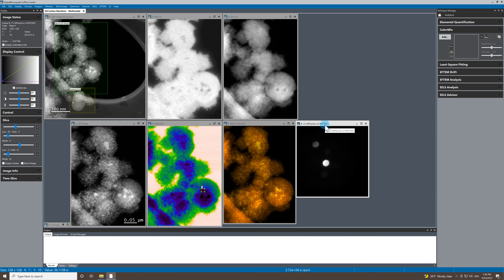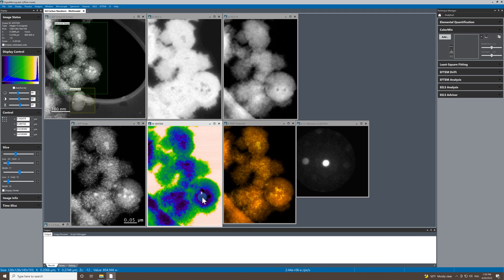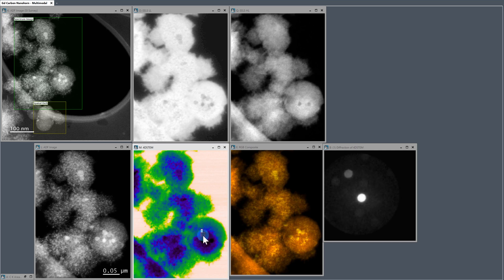If we change the gamma a little bit on that diffraction pattern, it kind of boosts our ability to see the diffraction disks. And if we move around, we can see that there's some interesting changes in the orientation of some regions in this area here.